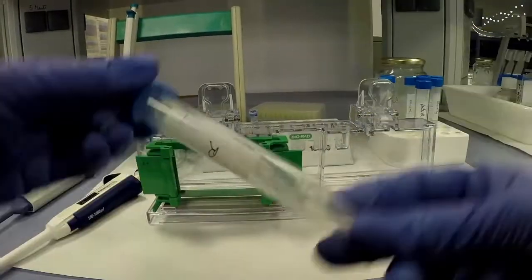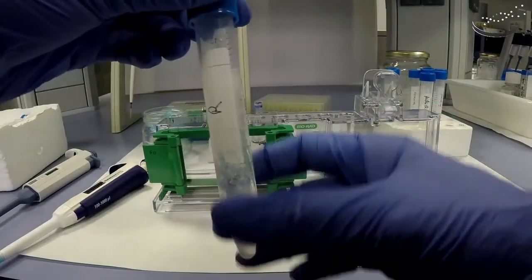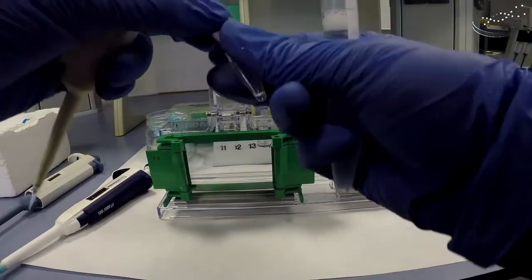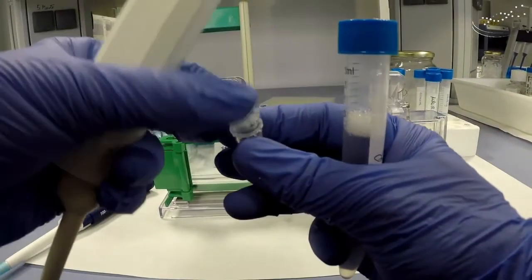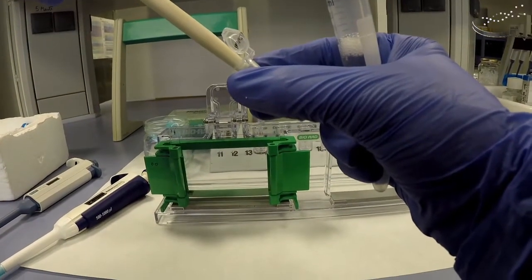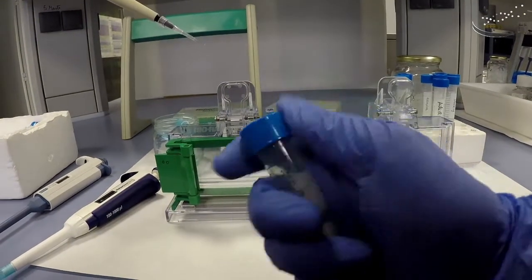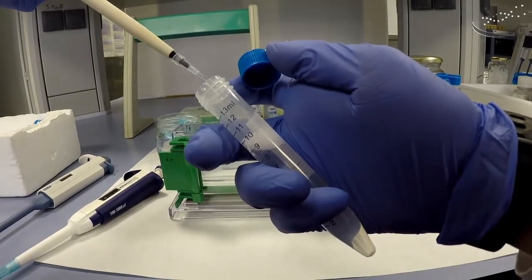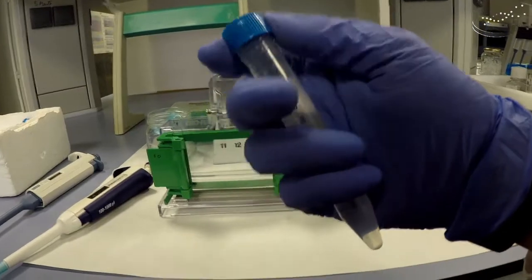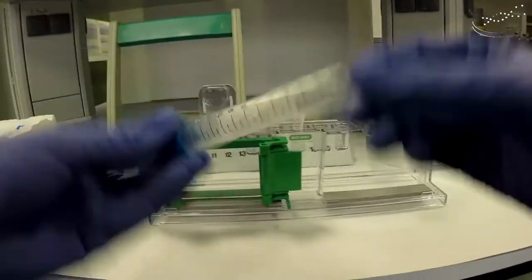We close the tube and invert several times to mix. We do this to avoid a local concentration between the APS and the TEMED, which would instantly polymerize and basically ruin our gel solution. Now with the 6 microliters of TEMED — get the appropriate volume, add it below the level of the liquid, insert your pipette tip below the level of the liquid, and dispense the 6 microliters. Mix well by inverting several times.